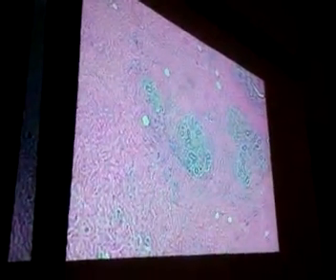There's a lobule. I might ask you to identify this structure, lobule. Yeah, this whole thing right there. There's another one over there. A lactiferous duct, I don't usually ask that, but that would be the lobule. The lactiferous duct, I think, is these things right here, according to Russ.